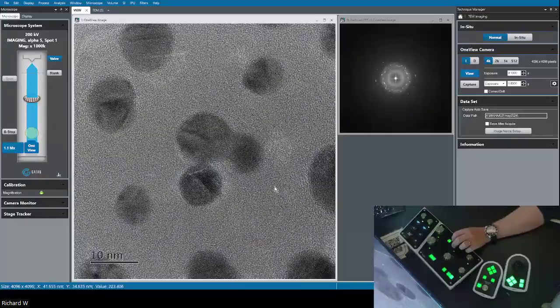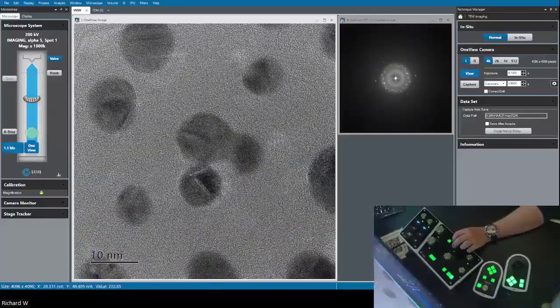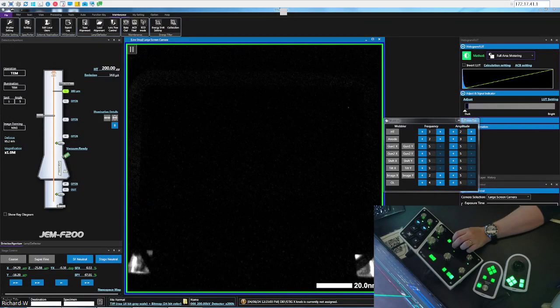All right. If we look at the dual computer, so that's here, on the right here, it says that we're at 95 nanometers defocus. Now, if I just reset that by changing the magnification up and down, so we didn't make an effective change, let's now set that to 0.